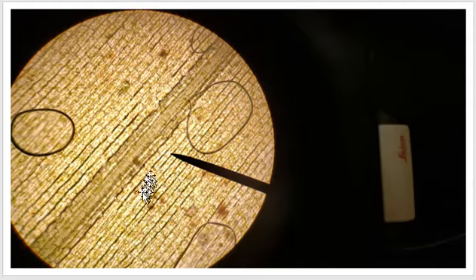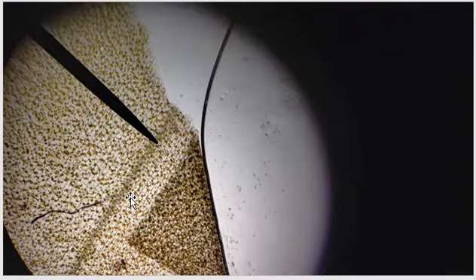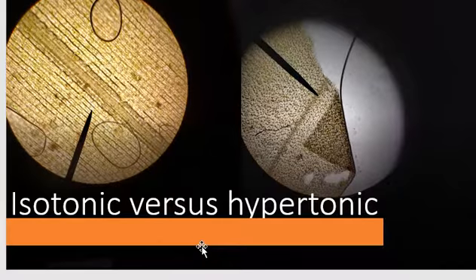Hi, this is Brother Barnes, and this is an isotonic elodea slide straight out of the aquarium. This one has been soaked in salt overnight. Notice the clumping of the chloroplast. And then here is a side-by-side comparison.